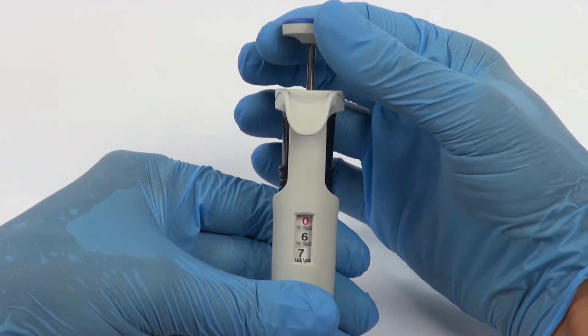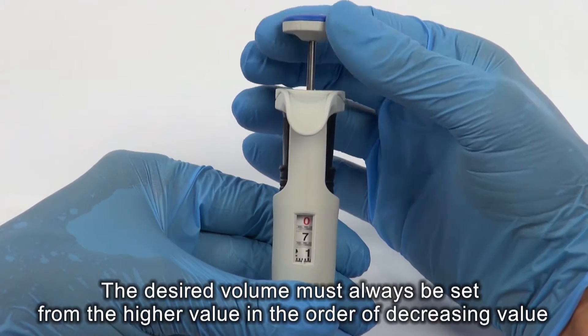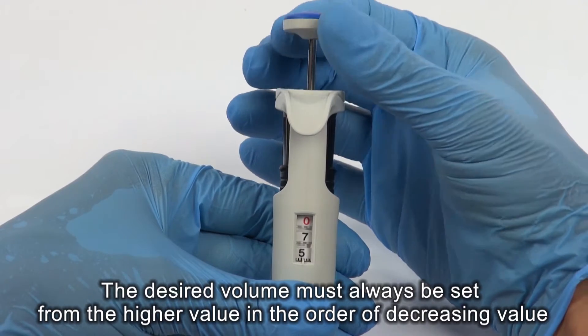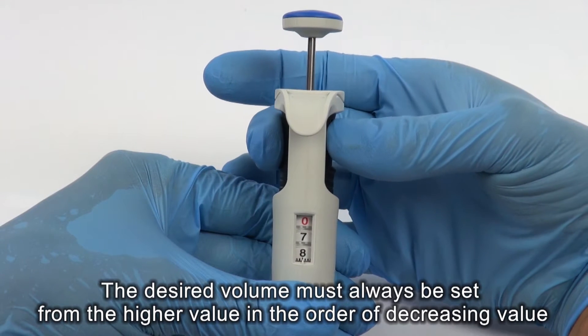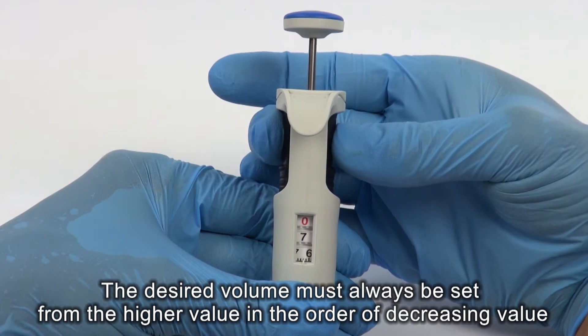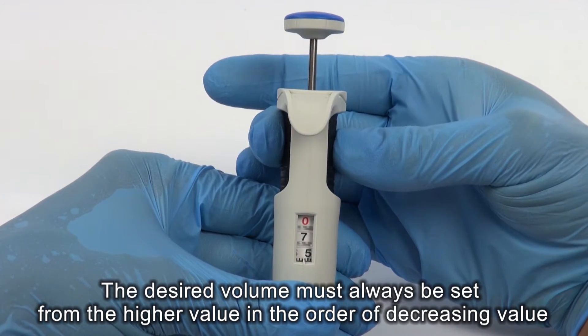If the desired volume is higher than the set volume, turn the pipetting push-button, increasing the value until the lower figure wheel comes one-third of a turn beyond the required setting, and then slowly backward.